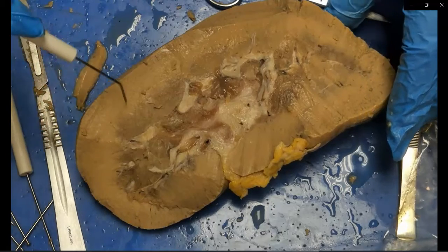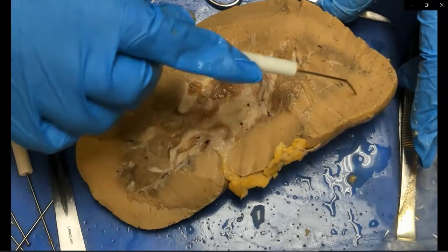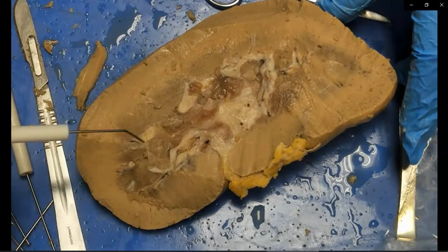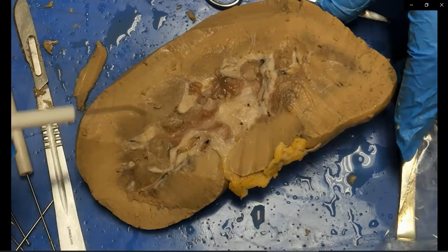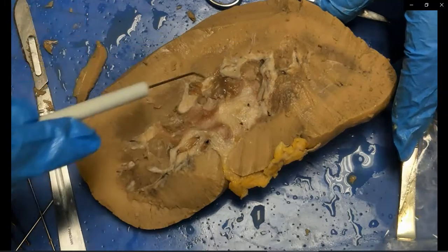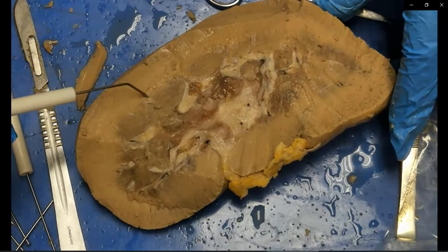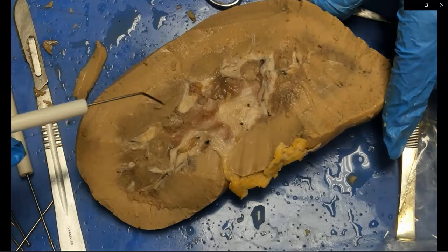So right here, this kind of tan, beigeish portion, all on the outside, that is referred to as the cortex. And then you see these darker kind of triangle areas. So all of this area is the medulla, the renal medulla, and then these individual triangle looking fan things, those are going to be your renal pyramids.